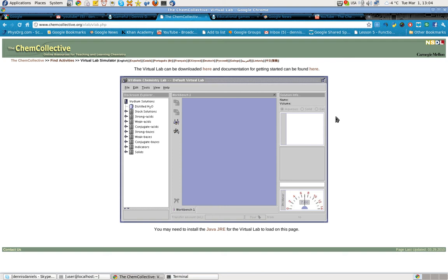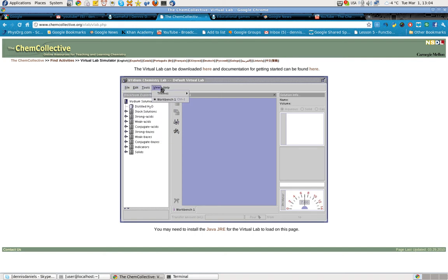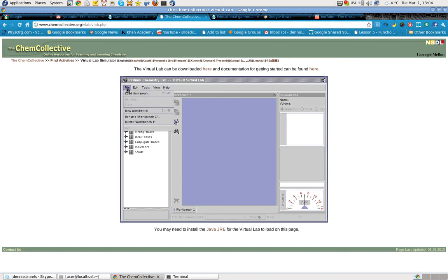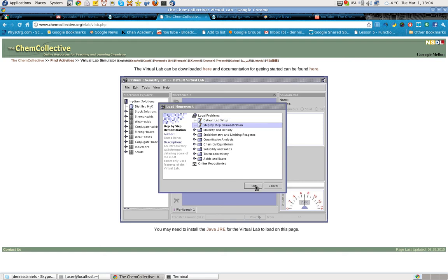What we can do are various experiments. We can load homework tools. Loading the homework, load a homework problem from the internet. I haven't done this yet, so let's take a look at it and see what happens. Right here, okay. Default lab setup, step by step demonstration. Let's go ahead and take a look at that.